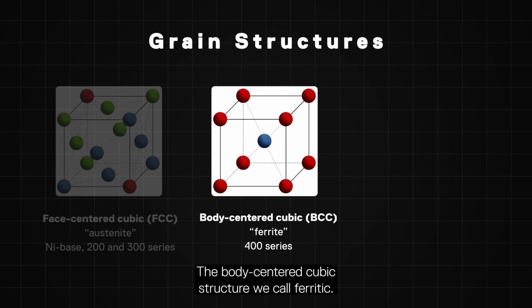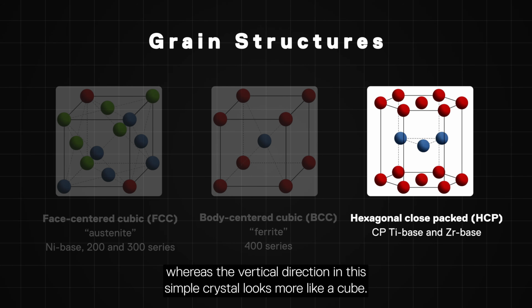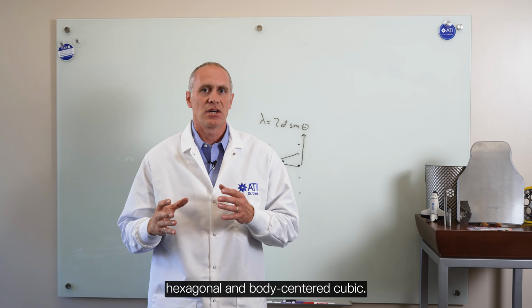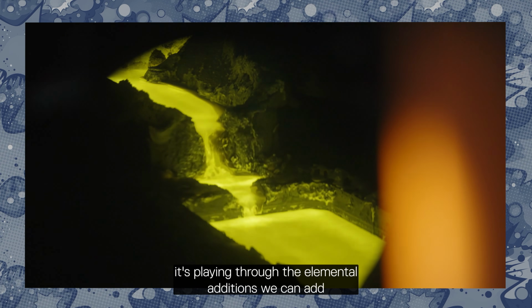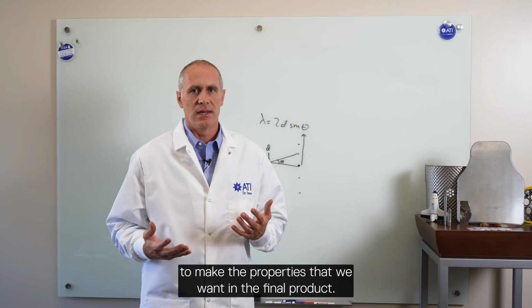The body-centered cubic structure we call ferritic. In the case of titanium, we have a hexagonal structure, so they're not cubic anymore. They're in the shape of a hexagon, but they're not even in each direction. The base looks like a hexagon, whereas the vertical direction in this simple crystal looks more like a cube. In really high-strength titanium alloys, we actually have a mixture in the structure of hexagonal and body-centered cubic. Ultimately, as material scientists and metallurgists, it's about playing through the elemental additions we can add and the processing we can do to create different structures to make the properties that we want in the final product.